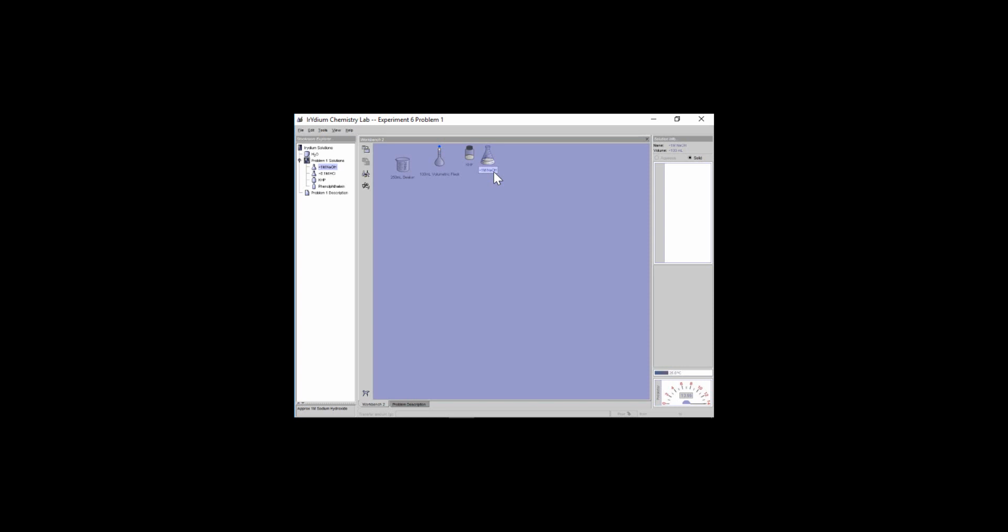So what I'm going to do is 1 set of titrations just to start off with the chemical that I know, KHP. Let's standardize the NaOH. Let's find that concentration really well. And once I know that NaOH really well, I can do another titration, use the NaOH now that I've standardized. Now I know the concentration really well. Use that to actually standardize, find the unknown concentration of HCl. So sort of 2 titrations in one. The calculations end up as a stoichiometry problem later on. It's just a little bit more work to actually get to those numbers. So let me first demonstrate to you how we're going to start with a primary standard KHP and make our first standard solution and start into our first titration between KHP and NaOH.